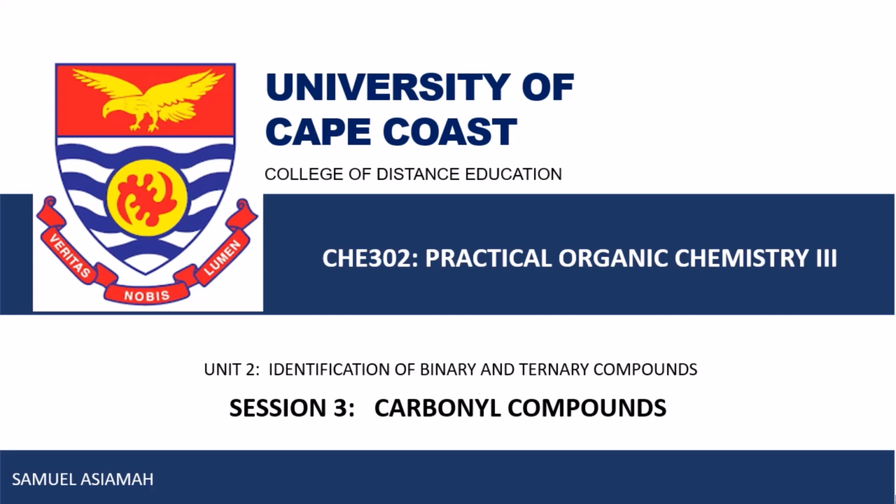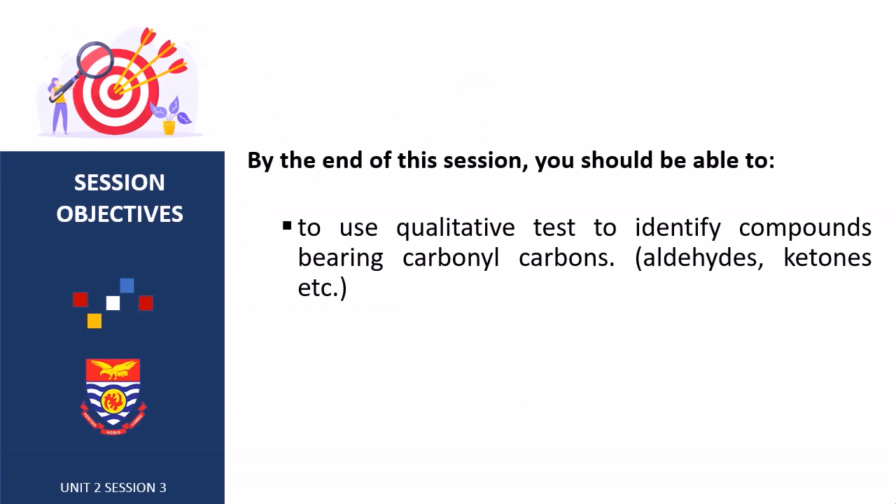Hello everyone, and you are welcome to the third session under Unit 2. In this session, we're looking at carbonyl compounds. At the end of the session, you should be able to use qualitative tests to identify compounds bearing carbonyl functional groups, such as aldehydes or ketones.